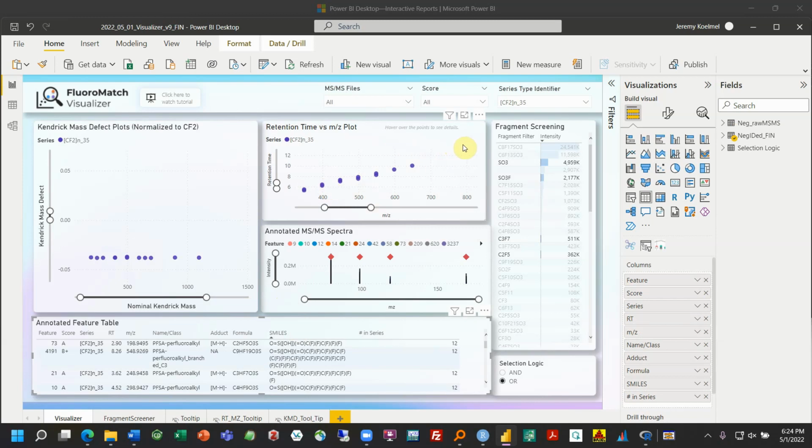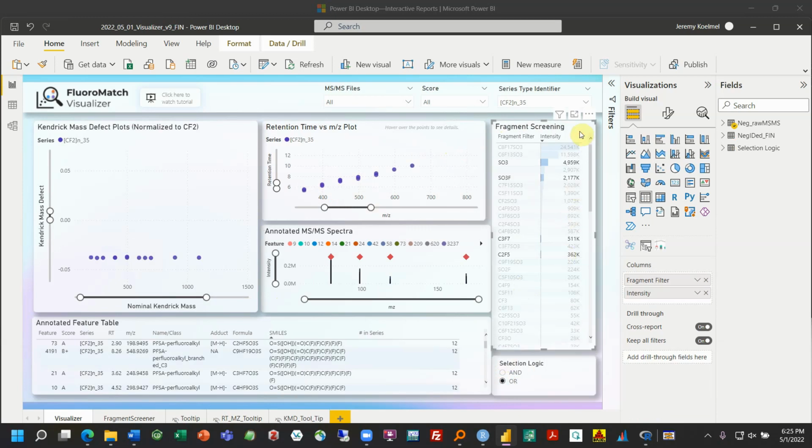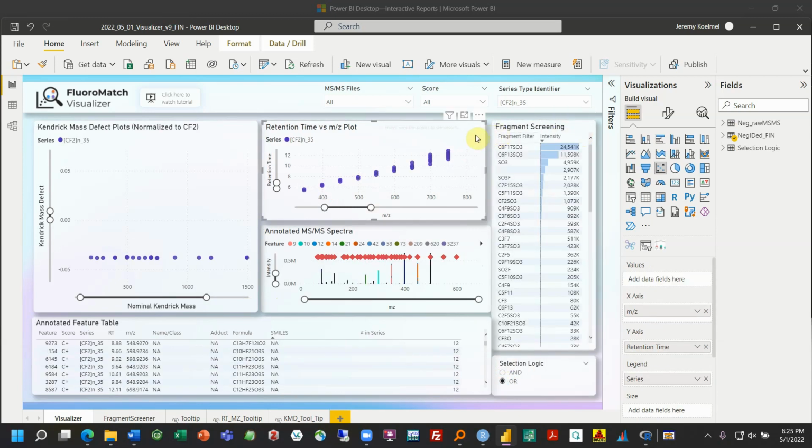So I could walk through these series. In this case, like I said, and let's say we want to refresh this, so we don't want to show the fragments, we can click around again on some of the boxes and eventually it will just refresh.